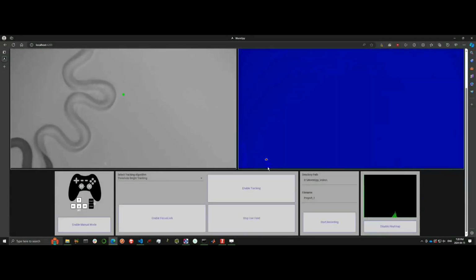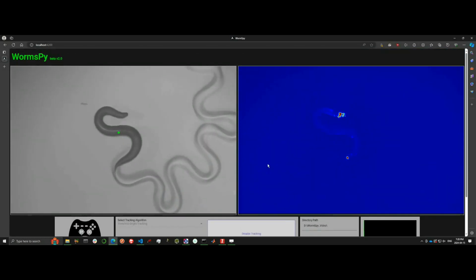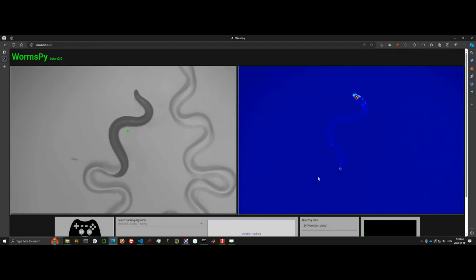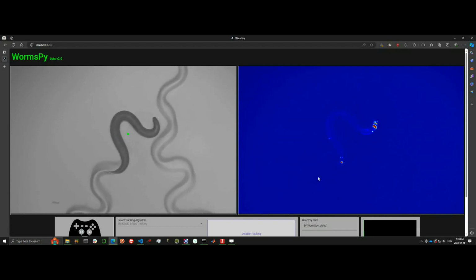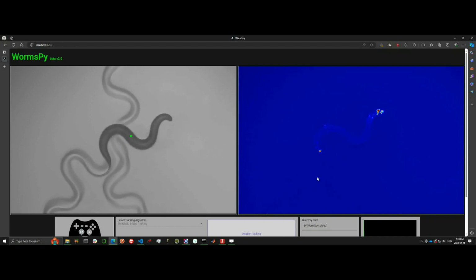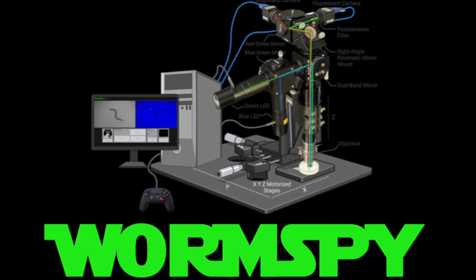And finally here we see a demonstration of using the bright background threshold-based tracking algorithm. In our case we are using a scikit-image technique, so we are tracking the averaged centroid of the worm, which prevents some of the smaller adjustments the motors need to make. There's also a dark background thresholding technique for tracking fluorescent markers included, as well as DeepLabCut. All of these techniques may require some modification to apply them to your use case.